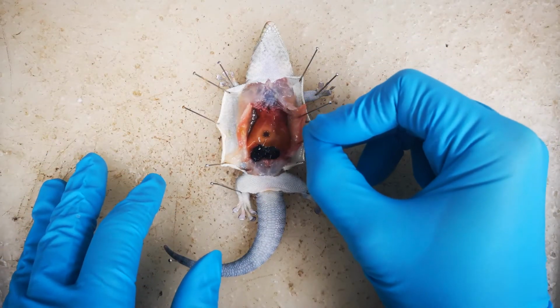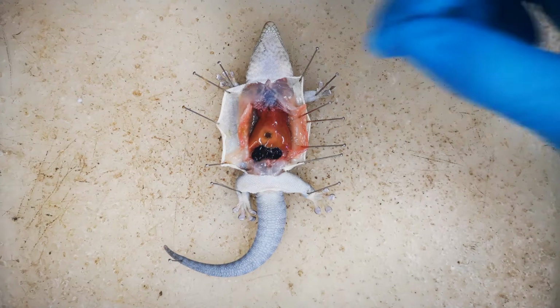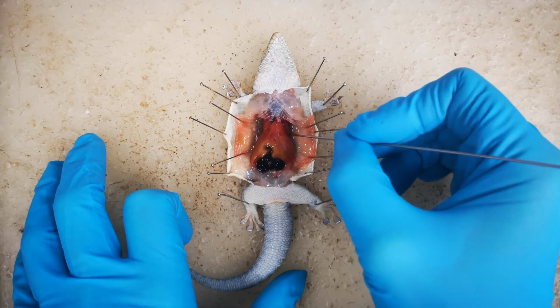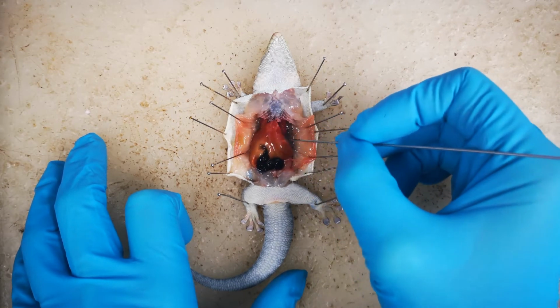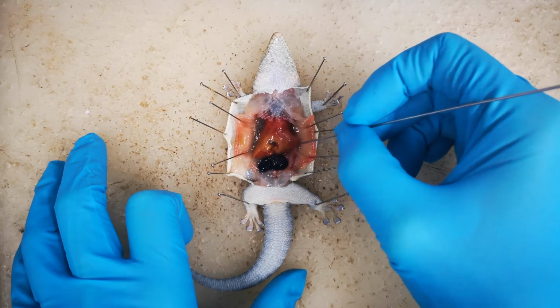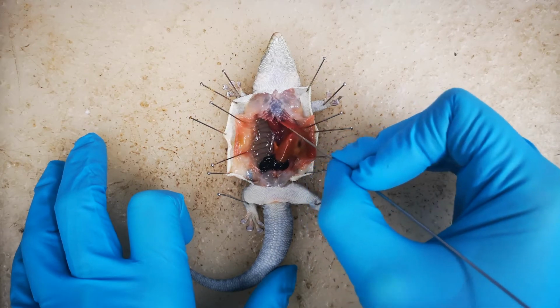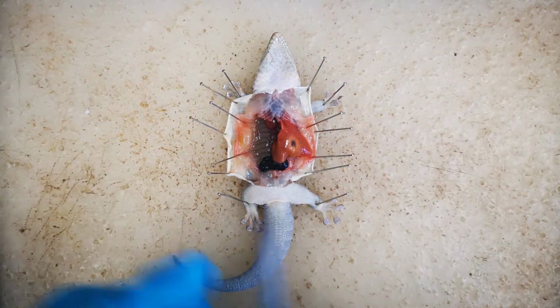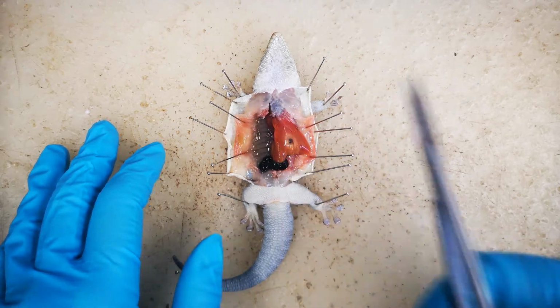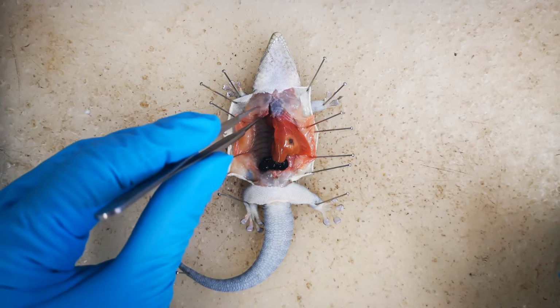The sides of the peritoneal space can then be pinned in place. We further cut through the rib cage anteriorly to access the heart and other anterior organs. We have to gently cut through the viscera to free the heart.